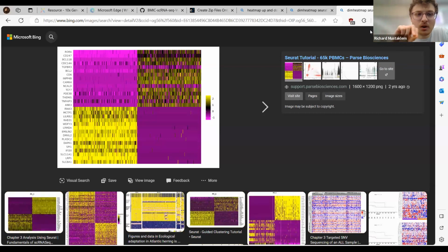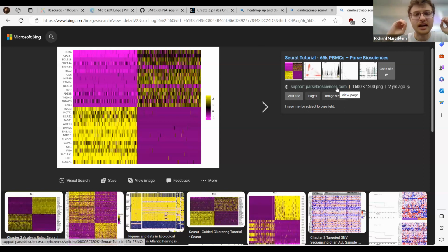If it's in PC1, we would want to investigate it because this is a very important set of our data, because it's principal component 1. But let's say it's in principal component 20 or 30. Then you can start saying, okay, this is just junk, let's throw it out. The reason is that you don't want to have too much upregulation and downregulation in the same quadrant. That means the genes are not clearly separated, and it could either mean one, that your data is weird, like you didn't clean it properly, or two, there is something interesting going on.